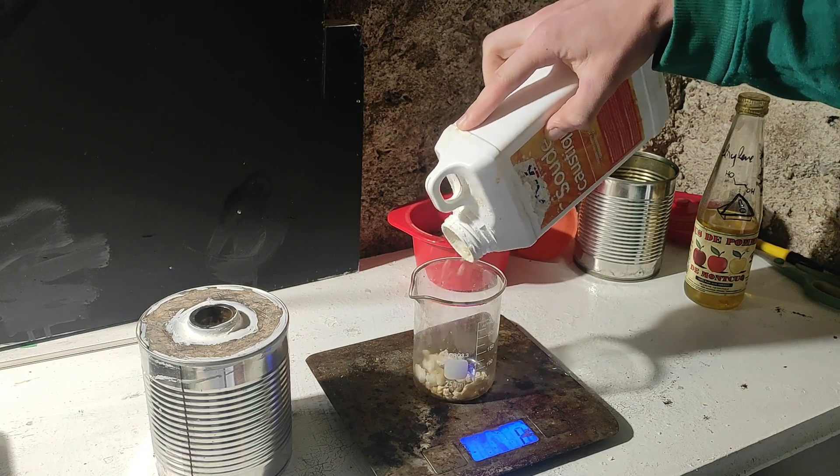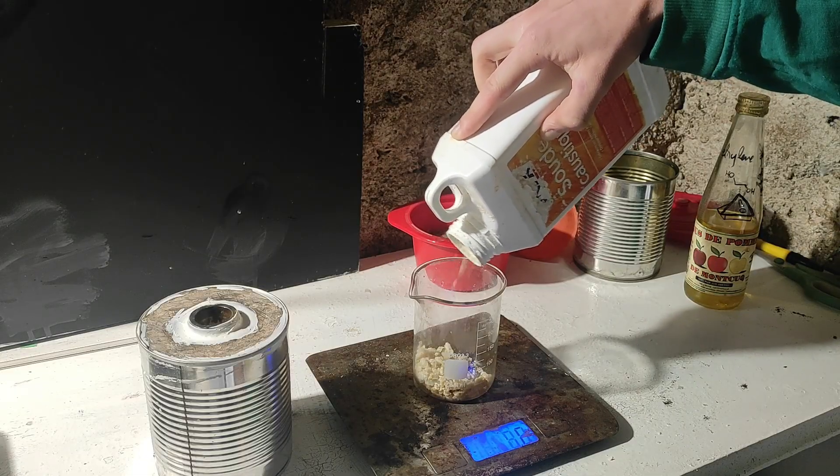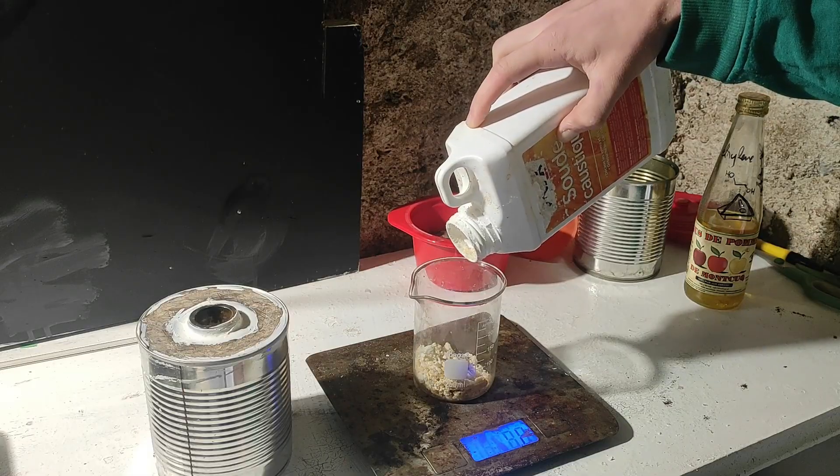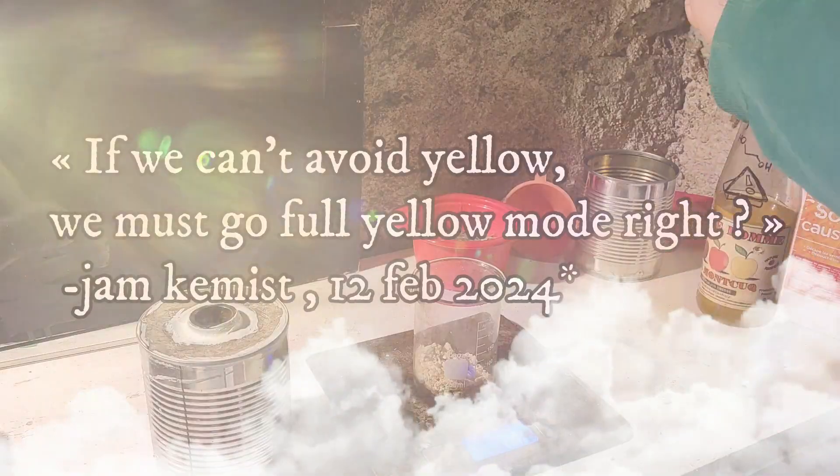For our second reagent, we need some sodium hydroxide, and add a large excess because we will need it later. As you can see, mine is very dirty and looks yellow, but why waste pure reagents when the whole reaction will look yellow anyway? If we can't avoid yellow, we must go full yellow mode, right?